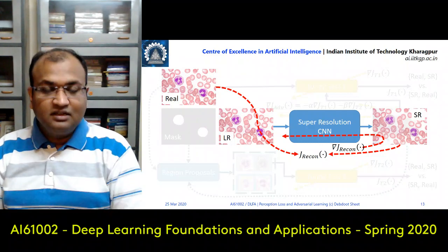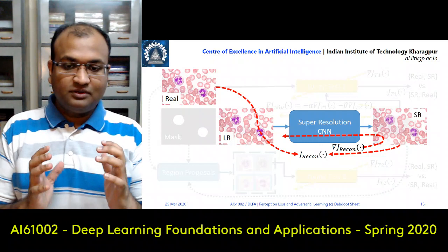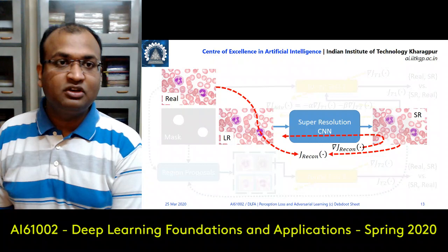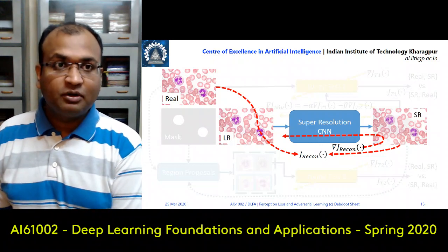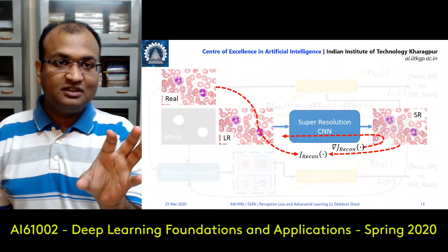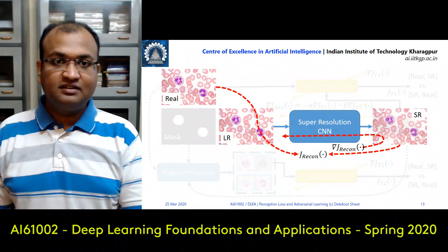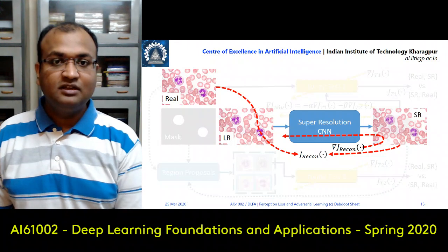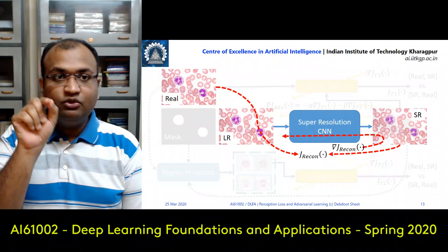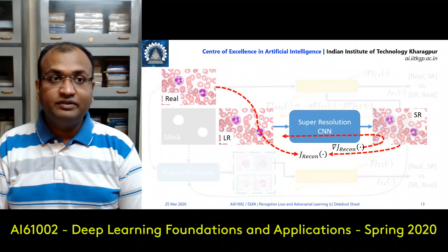And that's the learning trick over here. In general, when something goes down from a high resolution to a low resolution, you can pretty much assume that to be equivalent to an average pooling or a max pooling operation. It is the same kind of problem we had in max pooling. If you are doing an unpooling, you would replace it by the same value in all the 4 pixels if you are doing a 2x2 max pooling. But you don't exactly know whether that is what is coming, and there is no way to get down to the actual granular points from where these were coming. So this has to be taken care of, and somehow we need to solve this.